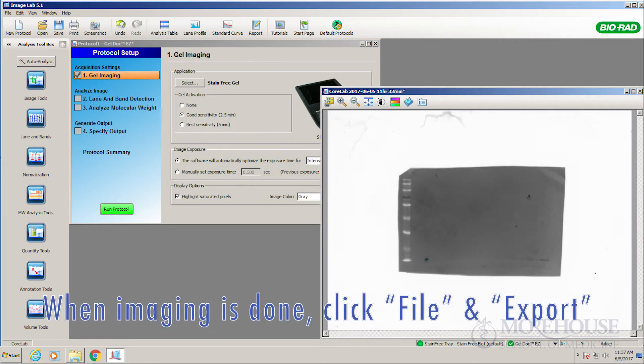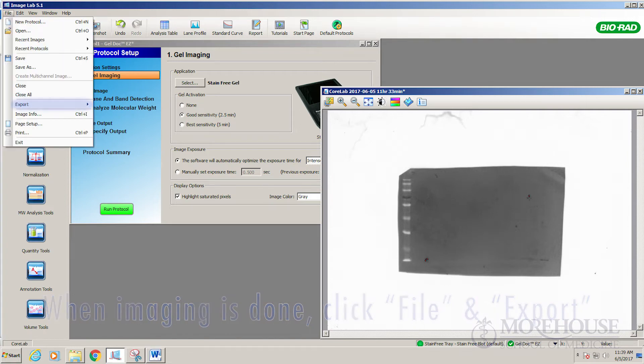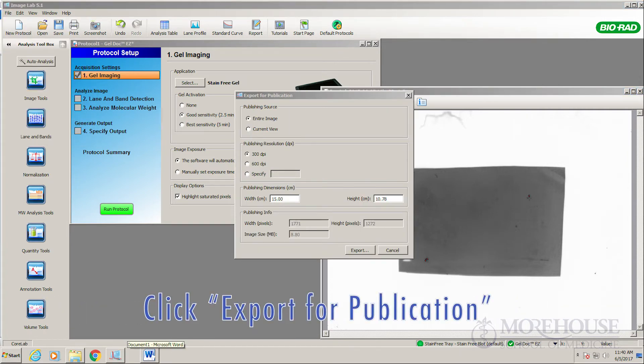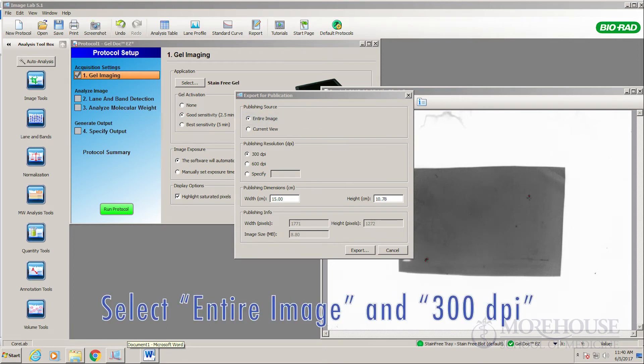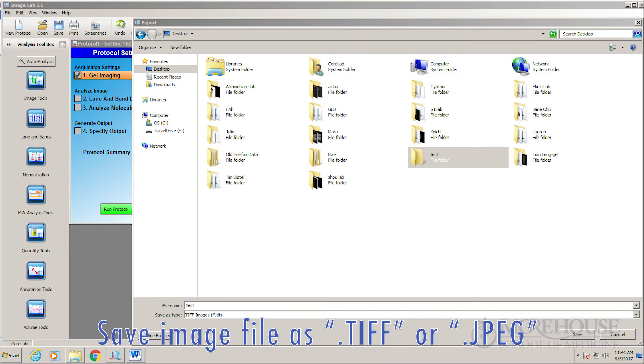When imaging is done, click file and export. Click file export for publication. Select entire image. 300 dpi. Save image file as TIFF or JPEG.